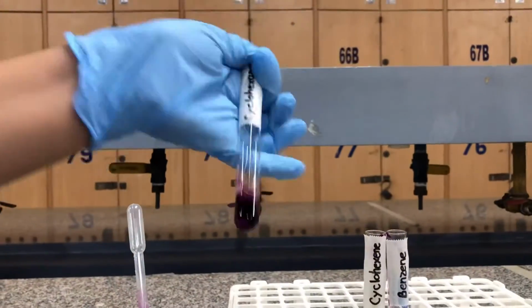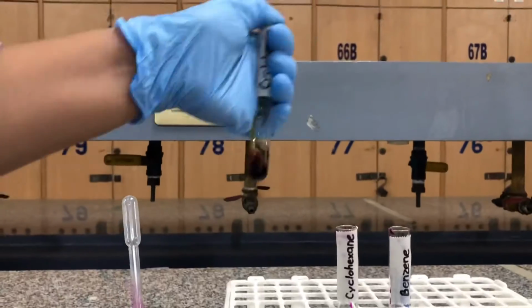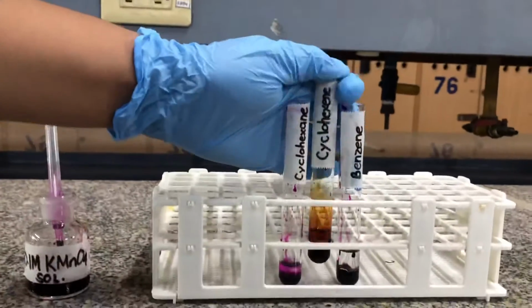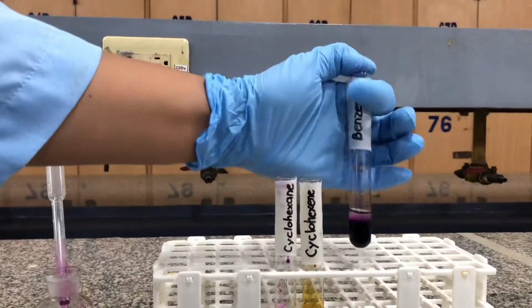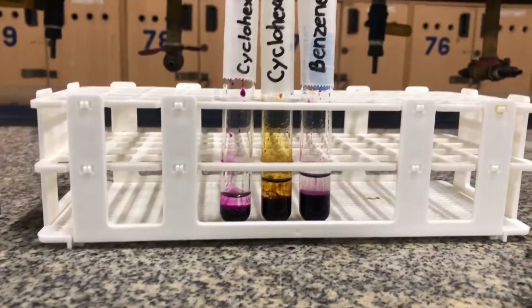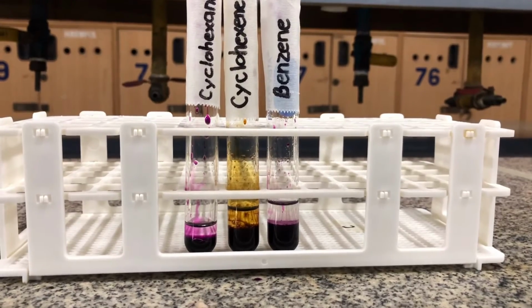Shake each test tube after the addition of the permanganate solution. The formation of a brown coloration is a positive test. This is indicative of the presence of unsaturated bond. To repeat, the reason for this is that the unsaturated bonds are able to reduce the purple permanganate to brown manganese dioxide.